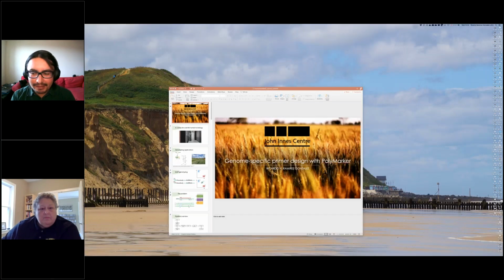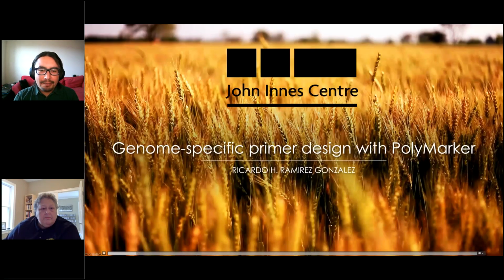Thank you, Kelly, and thank you everyone for attending. So yes, I'm Ricardo, and I'm going to be talking about genome-specific primer designs with PolyMarker. A lot of it is not going to be only about PolyMarker, but about the ideas behind it.